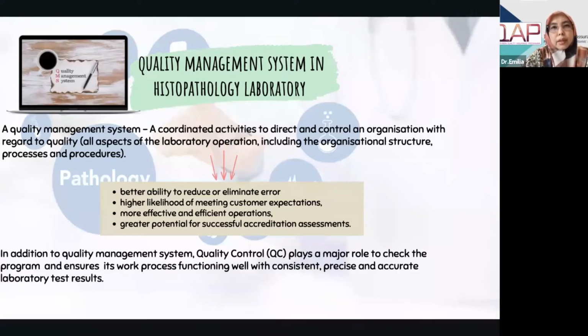Almost all of them, when we ask about the quality management system, or even any quality questions, sometimes have no idea, or maybe they just ignore it during training, or they don't care about this. Maybe they thought this is not their job yet, but like it or not, when you are a pathologist, you have to know it and you have to like it. So, the quality management system in the histopathology laboratory, for the introduction, before we go into further detail on the technical module.